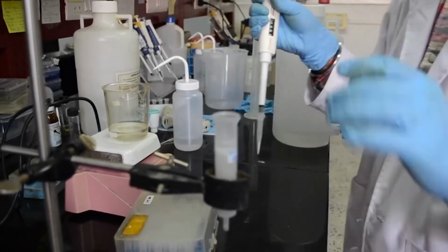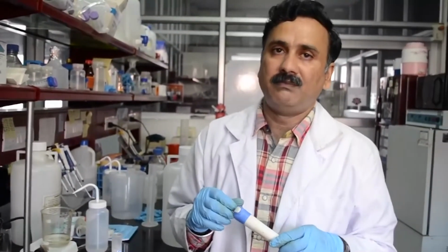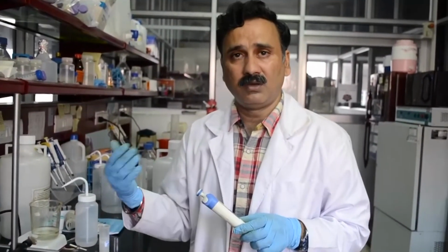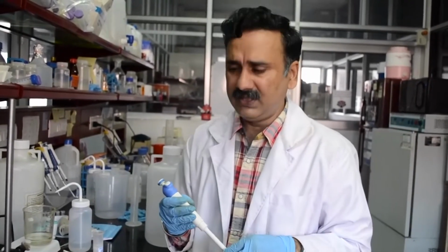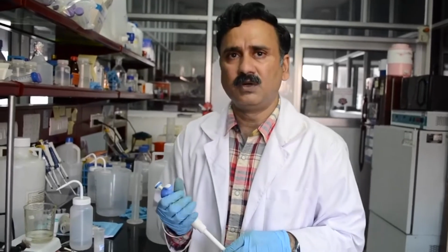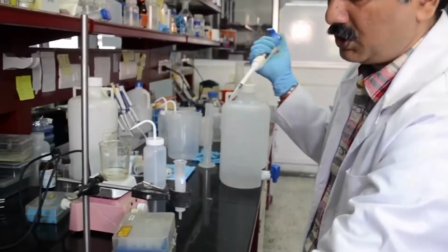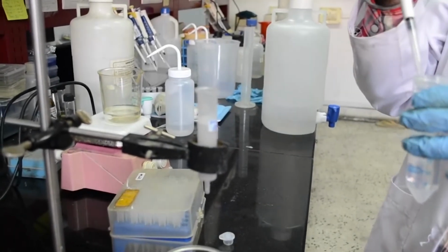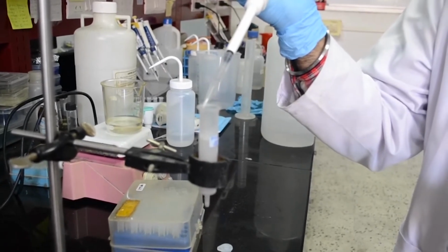This time we are running the column only in manual mode. If you are interested, you can also connect this column to a purification machine, but since this only takes 5 to 10 minutes, people normally don't prefer to connect the column to the purification system. What you see is that the buffer has now reached the disc, and now we can simply add the buffer or the water and fill it up to the top.